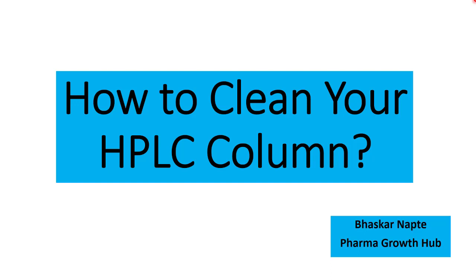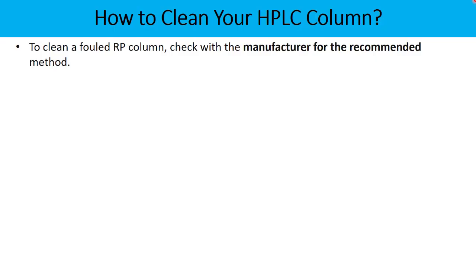Are you looking for effective column cleaning tips? My name is Bhaskar Napte and as a part of this video, we are going to talk about the very simple but effective column cleaning tips, especially for reverse phase liquid chromatography.